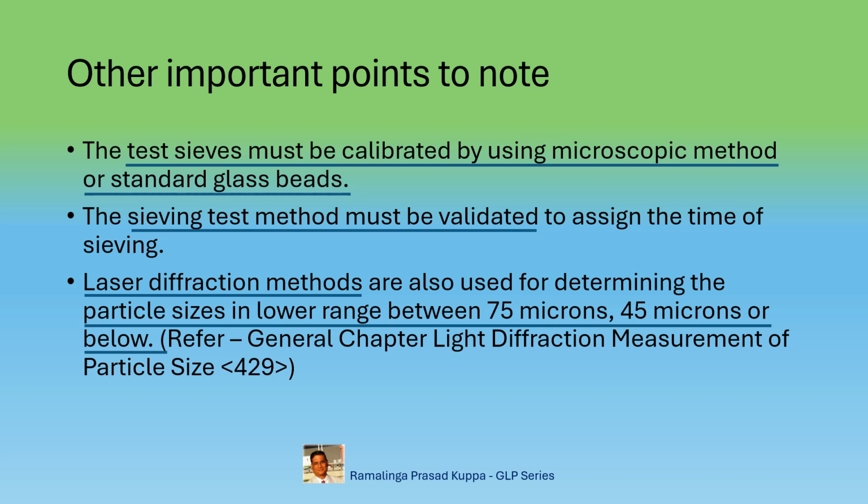On any other opportunity, I will try to make one more video on this chapter. I hope that the information on the particle size distribution is useful to you. Read carefully the entire chapter of 786 and check whether your SOP matches with these requirements.